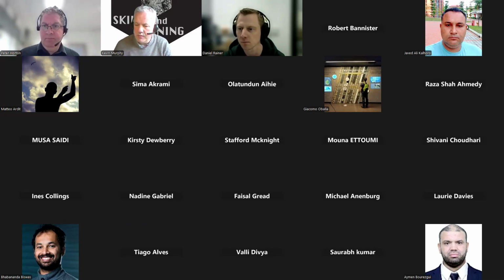Somebody's been busy typing. Musa asks, his research focuses on analyzing chemical composition of solid minerals and fluid inclusions using Raman. How far can the XRD and SEM-EDS be used when some minerals are Raman inactive?